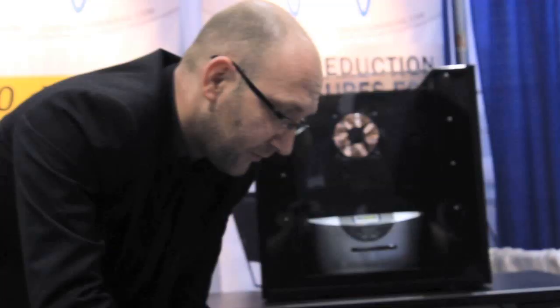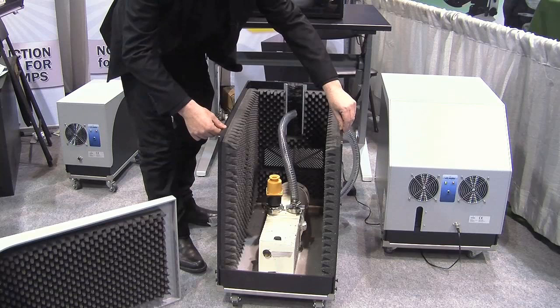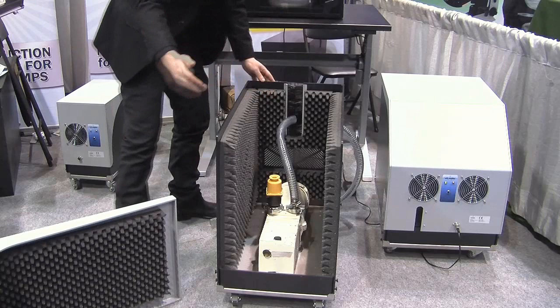It's very easy to install. The main feature of this enclosure is you do not need to shut down the vacuum pump. You just slide the base all around the pump, put all the pipes and wires through the slit, and it's installed.